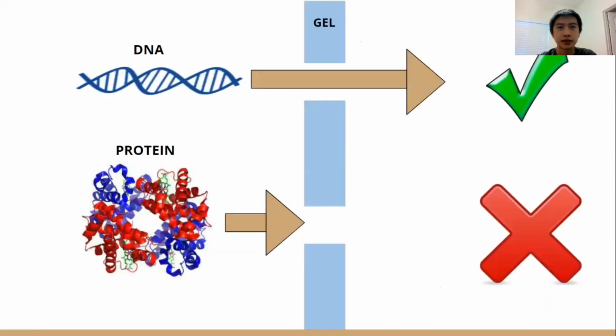And while gel electrophoresis had been working fine for DNA, there were a few other obstacles that had to be overcome when applying the process to proteins. The sugar phosphate backbone of DNA is linear and has a uniform negative charge that allows DNA to easily separate within the gel. Proteins, on the other hand, greatly vary in their properties. Compared to DNA, they are larger molecules, and their secondary, tertiary, and quaternary structures cause their shapes to be nonlinear and folded in all sorts of directions.